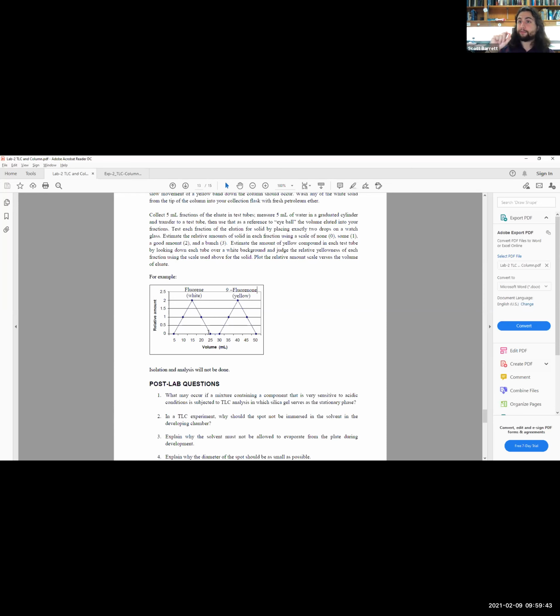Oh, okay, cool. It's getting stronger. Vial 4, that's the strongest. And then, okay, now it's fading away. Now we're getting a new band over here at vial 20. Let's say vial 4 was super good, and vial 22 was really good. You run them, and you'd see the first one would be really high on the TLC plate, super nonpolar. And then vial 22 would be in the middle of the TLC plate, more polar, less nonpolar. So that's the main thing, to get the distinction between the two.